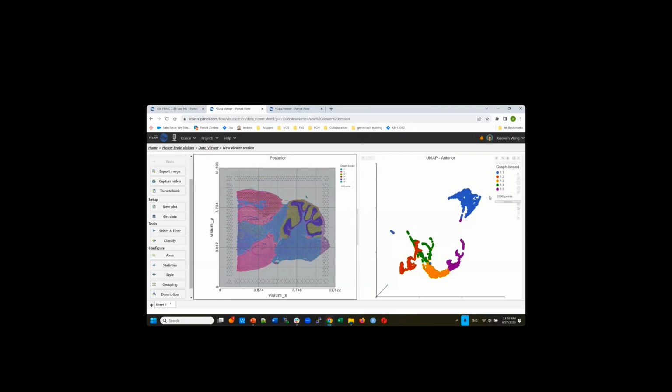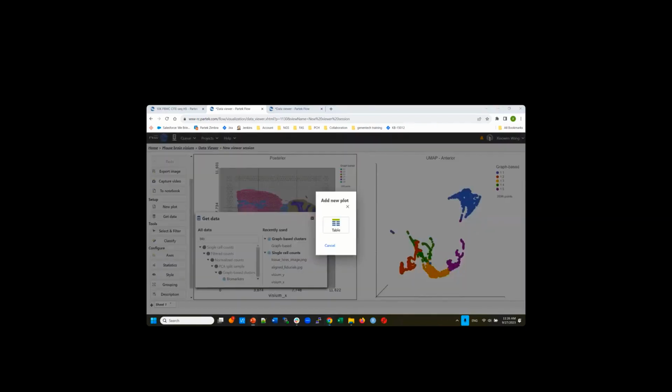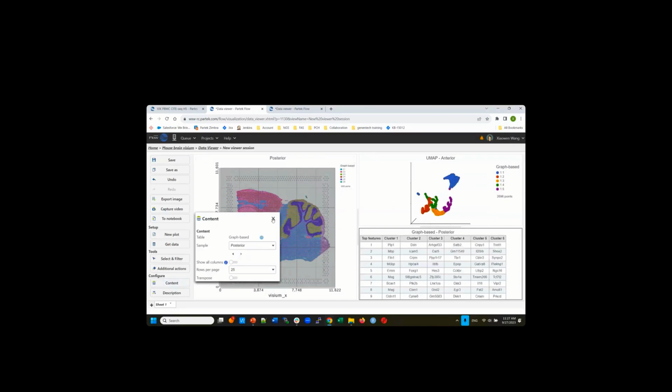You can utilize both. I would get my biomarker table. Suppose I found some genes that are anterior, and make sure your biomarker table is consistent with this posterior.